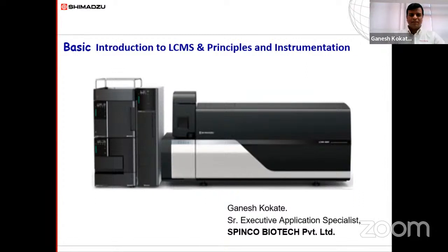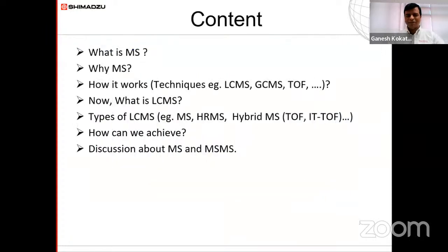As you see in the instrument, it's all about the LCMS. So LC is one part. LC we discussed yesterday. There are different detectors of the LC, and one of the detectors is MS. So in simple language, it's one of the simple detectors, but we will cover what is inside the detector as such. So in today's session, this is my agenda.